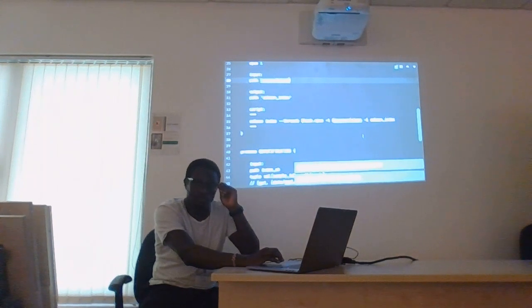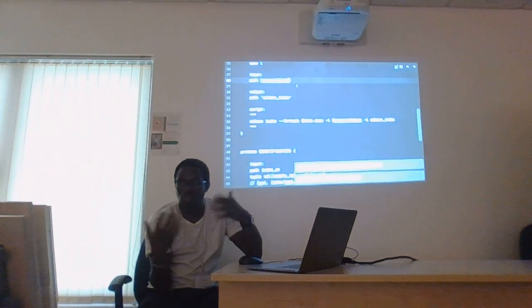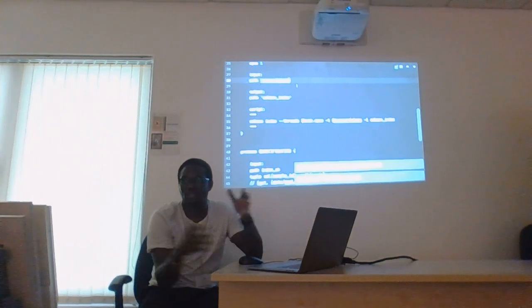Definitely it's true. Sometimes you might have more than one input with Nextflow, which allows you to pick different inputs as part of your script, to specify the inputs in the scripts. You could have a database as one of the inputs, or FASTA as one of the inputs, so you can just send them. And because these are channels, you can use other transformation functionalities. At times you may want to mix those channels, such that you want only your read ones to be in one channel.